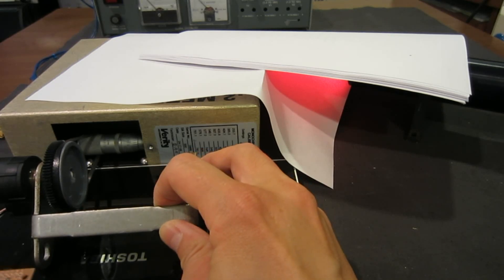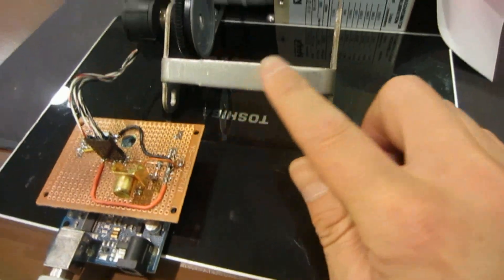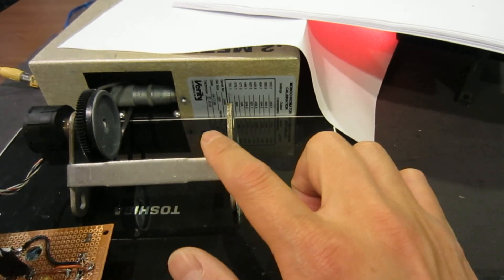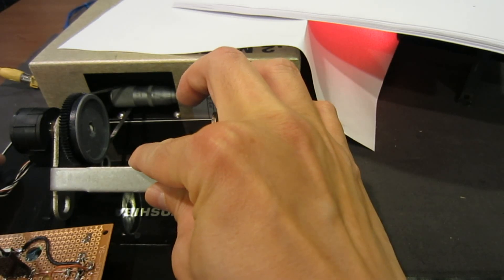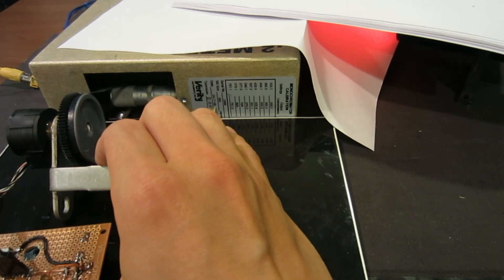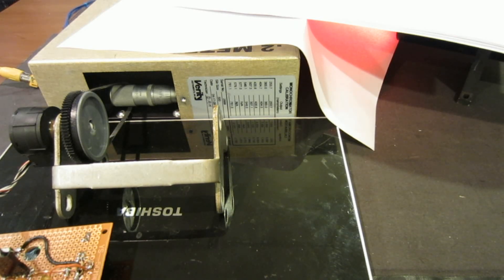Here is the setup you saw earlier. This is the Arduino board, and this is the assembly — the pulley with the optical encoder and the cogwheel belt attached. I can move it back and forth. What I'm going to do is while operating this monochromator, I'm going to use my finger to gently pull this against the monochromator so that we maintain a little bit of tension to make sure the wheel does not come loose and precisely records the pulses.